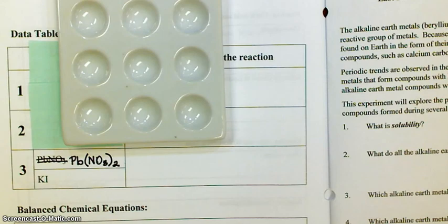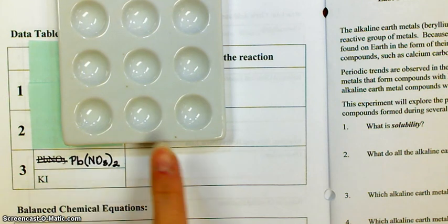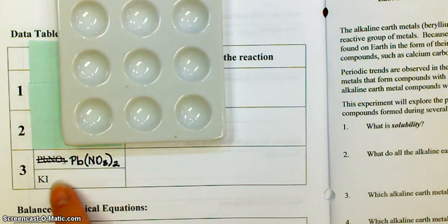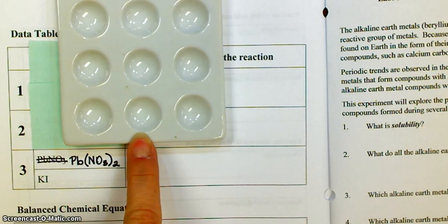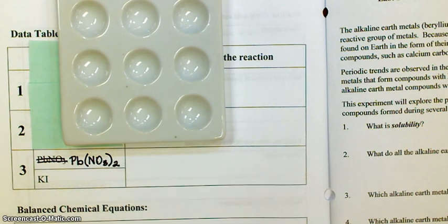Okay, on the third precipitation reaction, the first formula is actually incorrect, so please make that change to the formula, and then we will see what we get. I'm going to put the Pb(NO3)2. That's lead nitrate. It's going to go in this first well of the spot plate. Potassium iodide, or KI, is going to go in the second well of the spot plate, and then the third well of the spot plate is where the 2 of them will react.